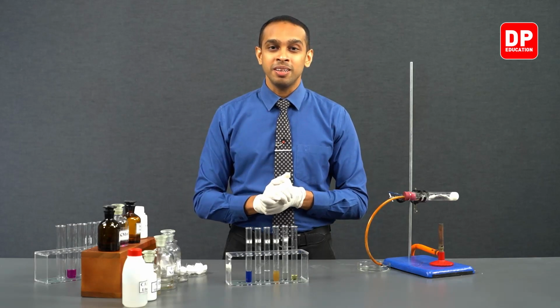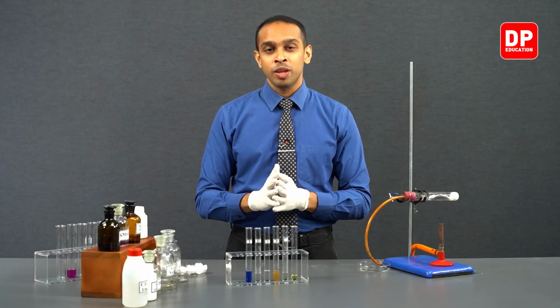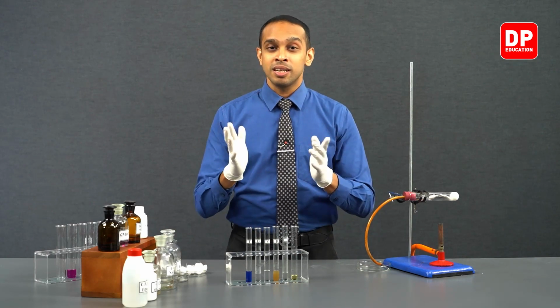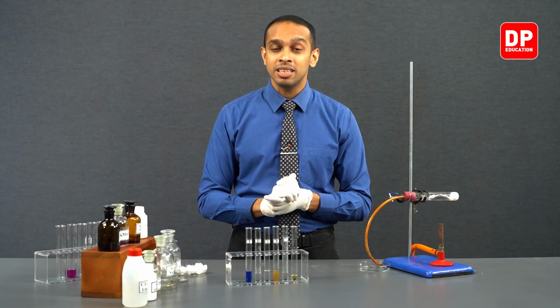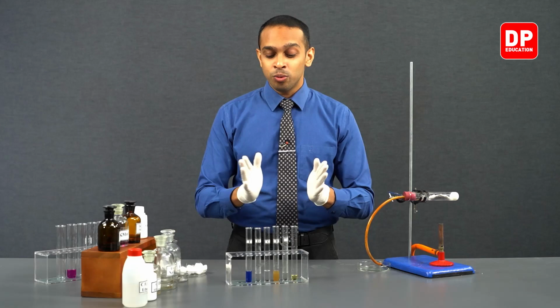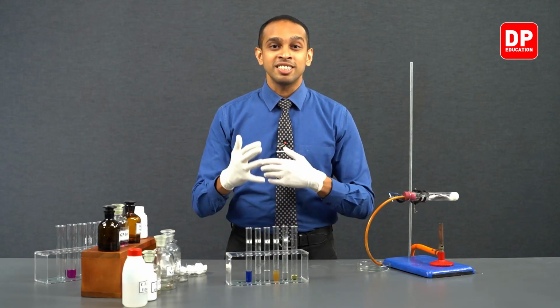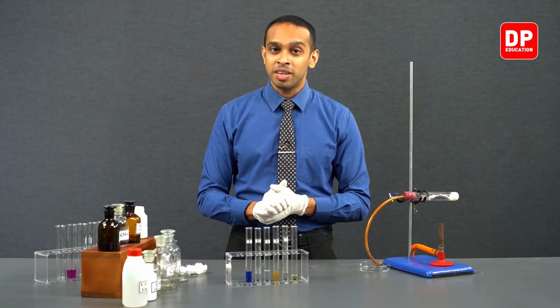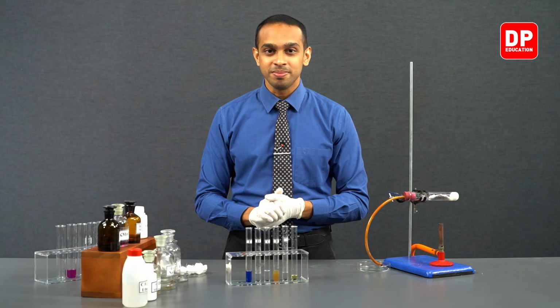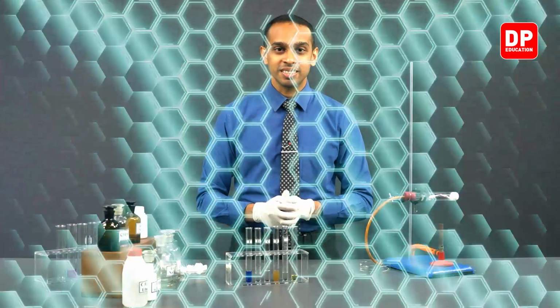With that summary, we can now move on to the second part of this experiment, where we will be producing an alkyne, which is ethyne or acetylene, and we are going to react the ethyne gas with these reagents and observe the changes that take place. Now let's move on to the second part of our experiment.